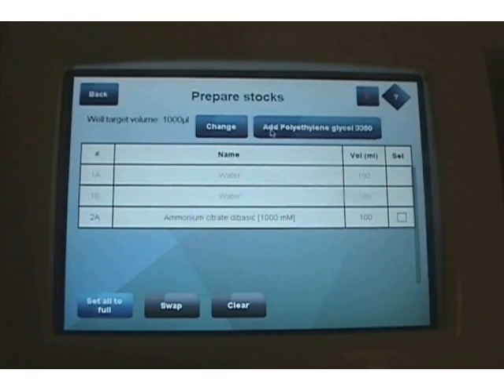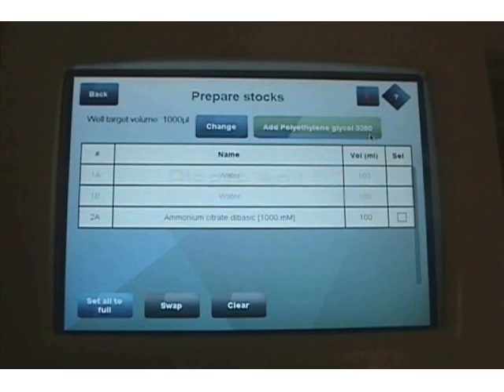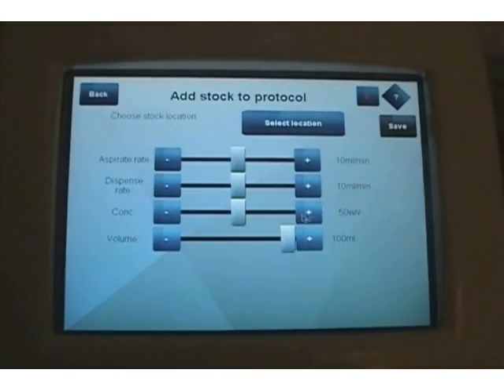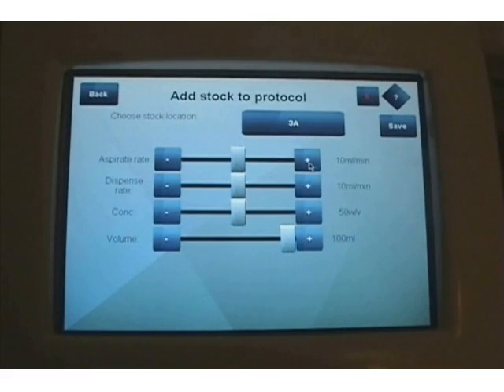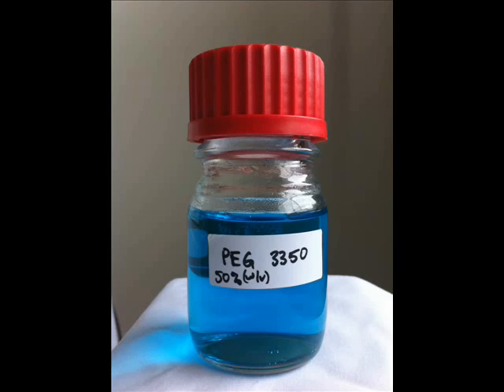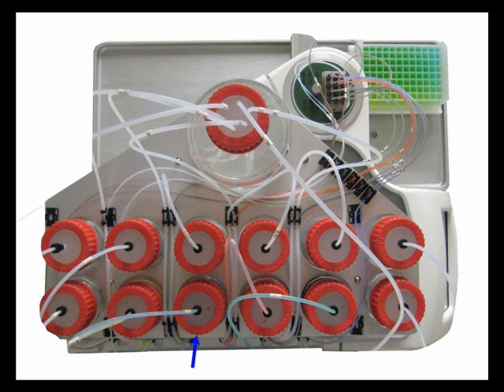The instrument knows it needs the PEG3350, so it asks for it, just like it did for the Ammonium Citrate. I go through the same process. This time, I don't need to adjust the concentration, as I'll be adding 50% weight per volume PEG3350 as my stock solution. I select position 3A for the PEG and save. Here is my 50% weight per volume PEG3350 solution, dyed blue for this demonstration. I place it in position 3A, secure the tubing, and I'm ready to go.